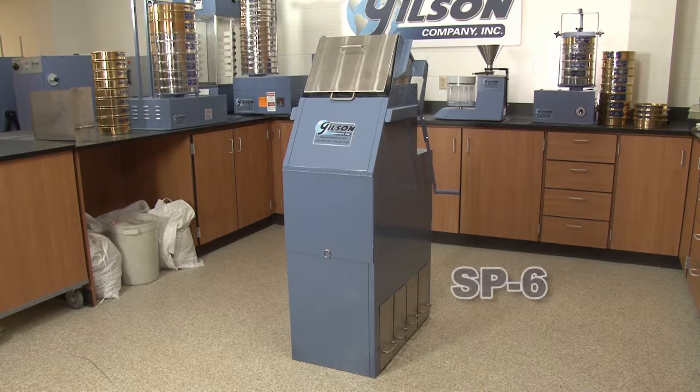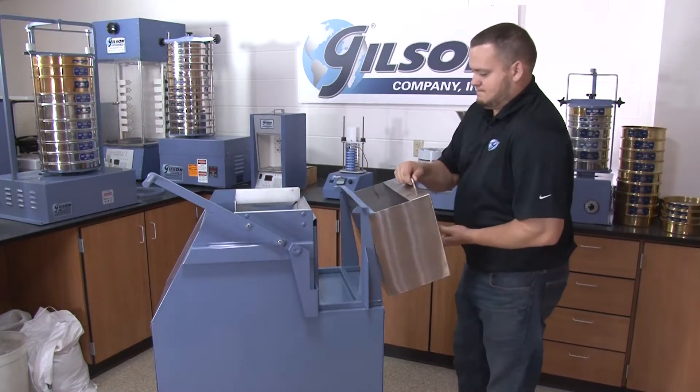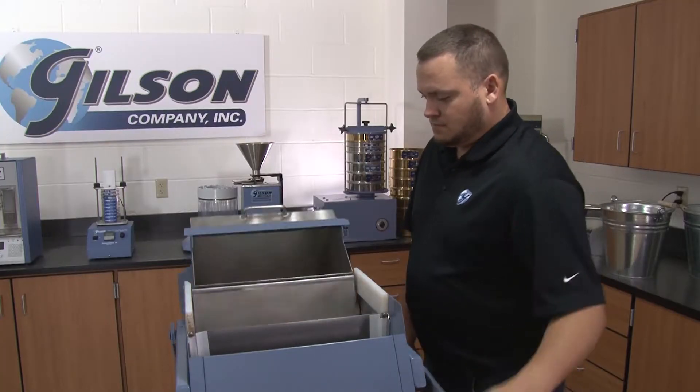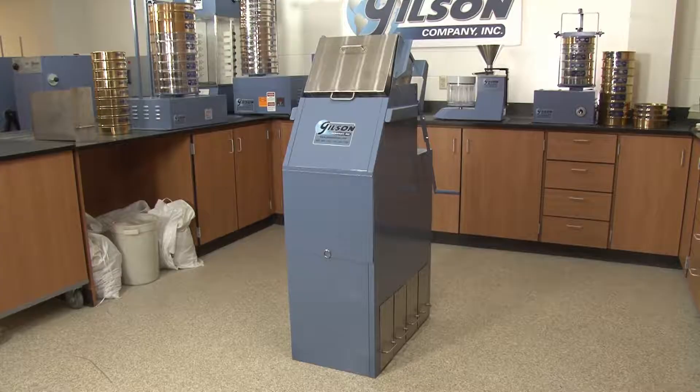Gilson offers the QuadraSplitter, an enclosed sample splitter which efficiently divides free-flowing material into four representative samples in a single pass, while significantly reducing nuisance dust in the lab.